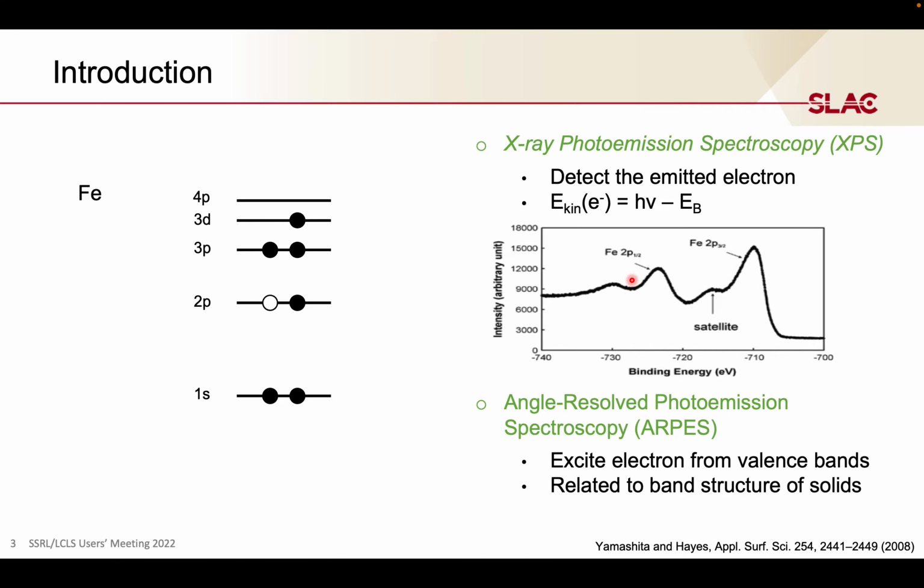We have LS spin-orbit coupling, meaning J equals 3/2 or 1/2 because L equals 1, S equals 1/2, and then it's 3/2 and 1/2. And since it's a strong spin-orbit coupling, we usually speak about jj coupling. And so, besides the two regions, you also have a lot of final states underneath.